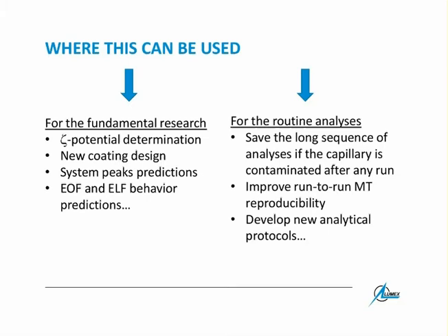So you have, for example, the analysis of DNA, RNA today, and tomorrow you wish to analyze proteins. So what should you do actually? Because it's clear that you should not use the same capillary, because to analyze proteins and to analyze DNA, RNA, oligonucleotides, you should use totally different buffers with totally different additives.